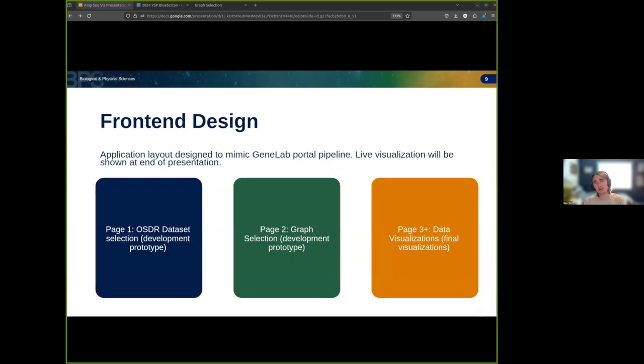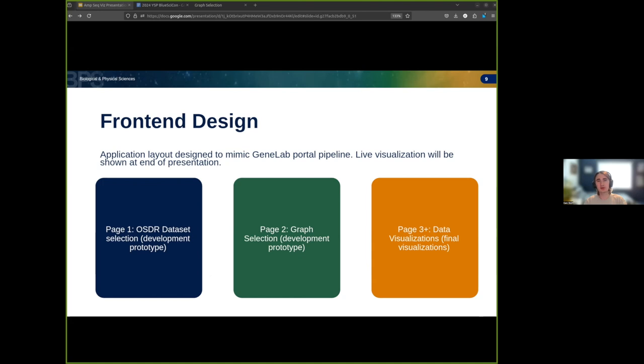When you first visit the website, you'll see a menu to select an OSDR dataset to download. This page mimics the assay selection table in the GeneLab portal. While this feature is not currently integrated with the rest of the application due to limitations in the GeneLab open API, a dataset will still be downloaded for users who want to run the server locally and manually run the dataset through the Amplicon sequencing pipeline.